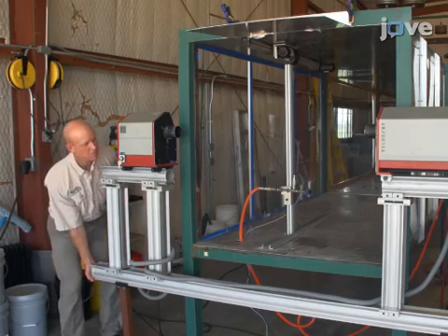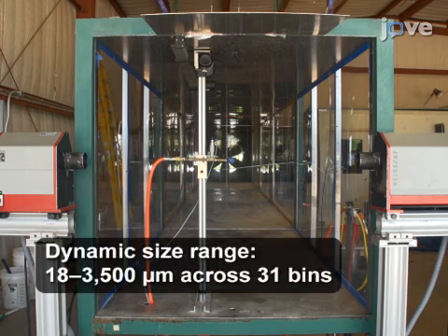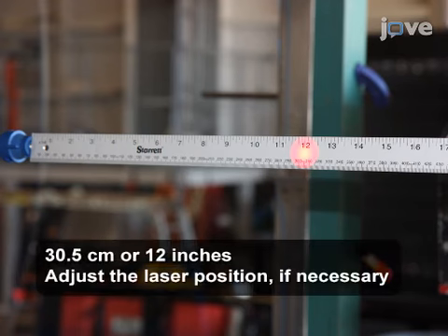Measurements take place just outside of the wind tunnel. Properly align and configure the laser diffraction system in front of the wind tunnel and nozzle. Before proceeding, measure the distance from the nozzle outlet and the system's measurement zone. The distance should be 30.5 centimeters.